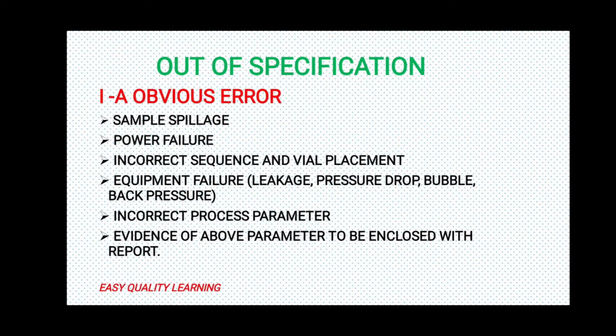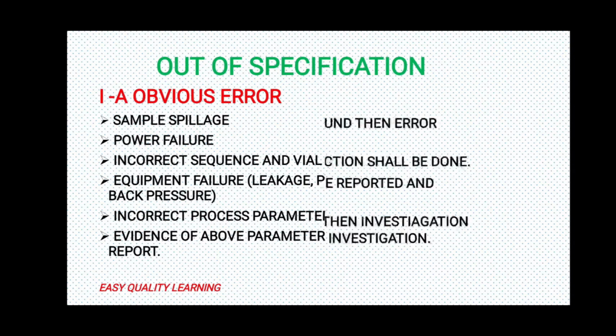So, what can be the evidence? Your pressure graph can be evidence, and whatever messages we are getting on the message center for power failures, door opening, back pressure, overpressure or leakage. Those messages can be taken as evidence and can be enclosed with our investigation report.